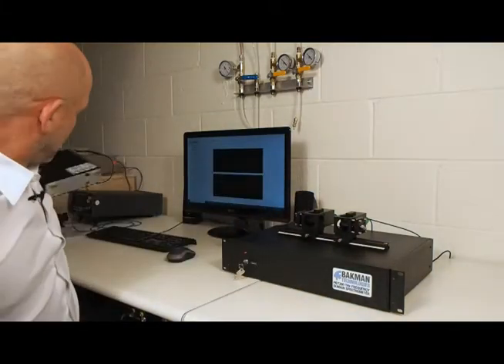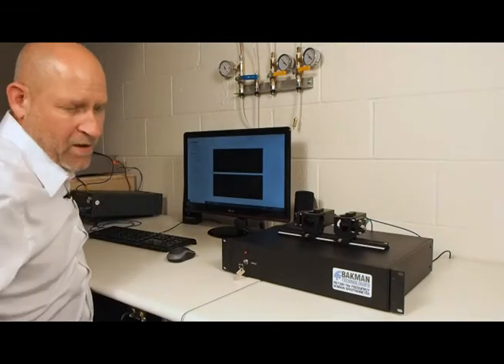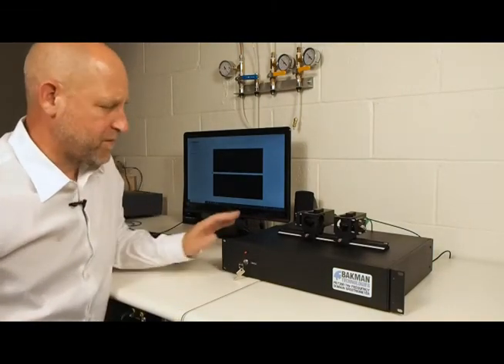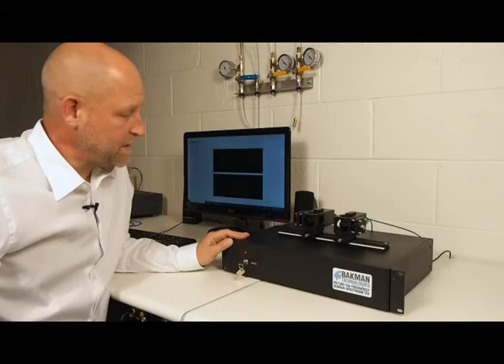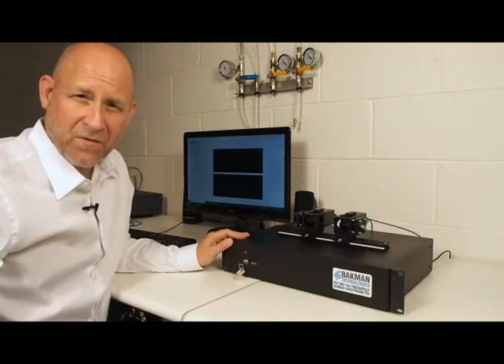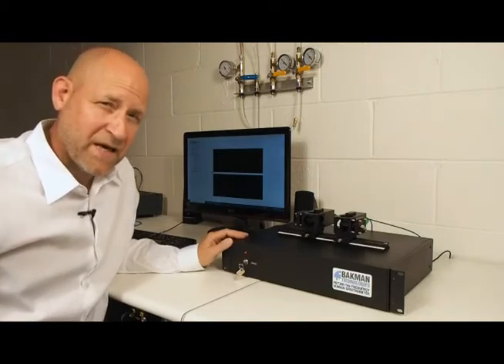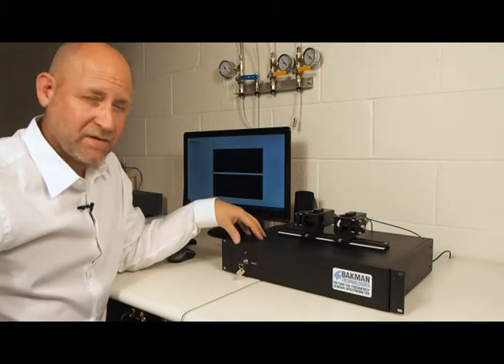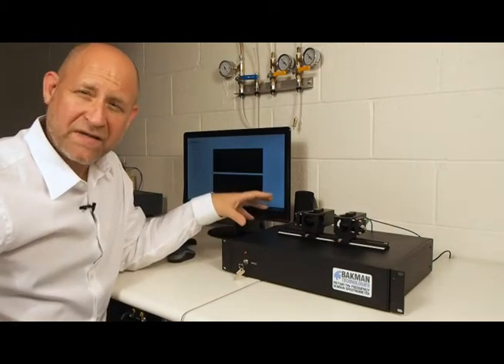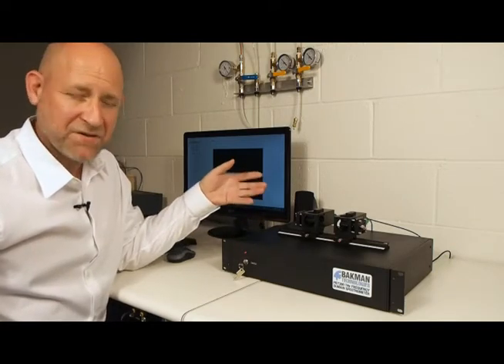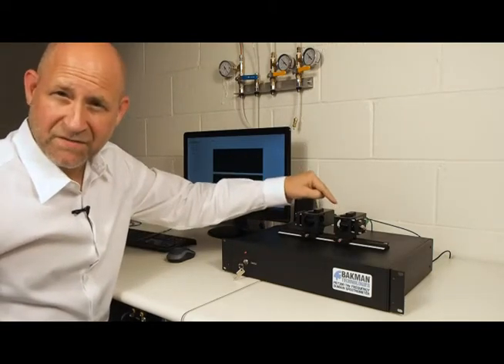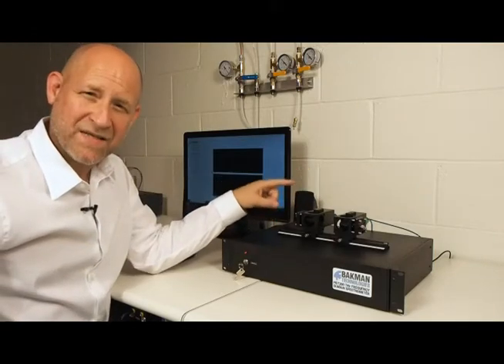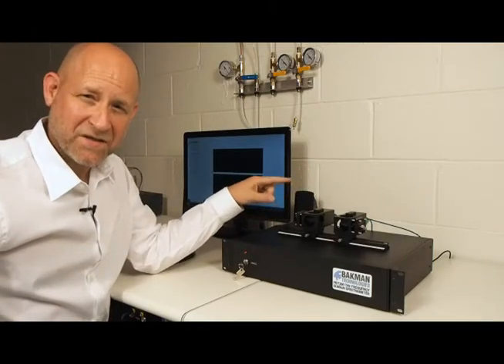We also offer the terahertz spectrometer, the PB7300, in rack mount for customers that just want to use it in the laboratory and maybe want some custom modifications made. This particular unit has an optical phase modulator installed. This allows us to modulate the terahertz radiation at 6 kilohertz and then detect the first and the second harmonics of the modulation.